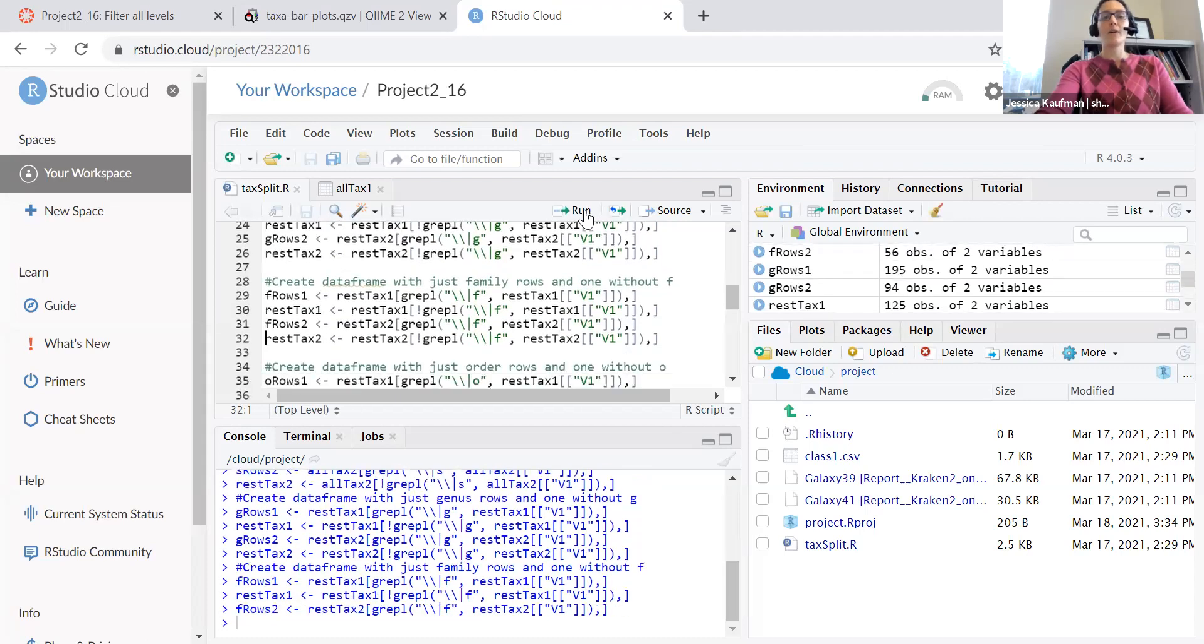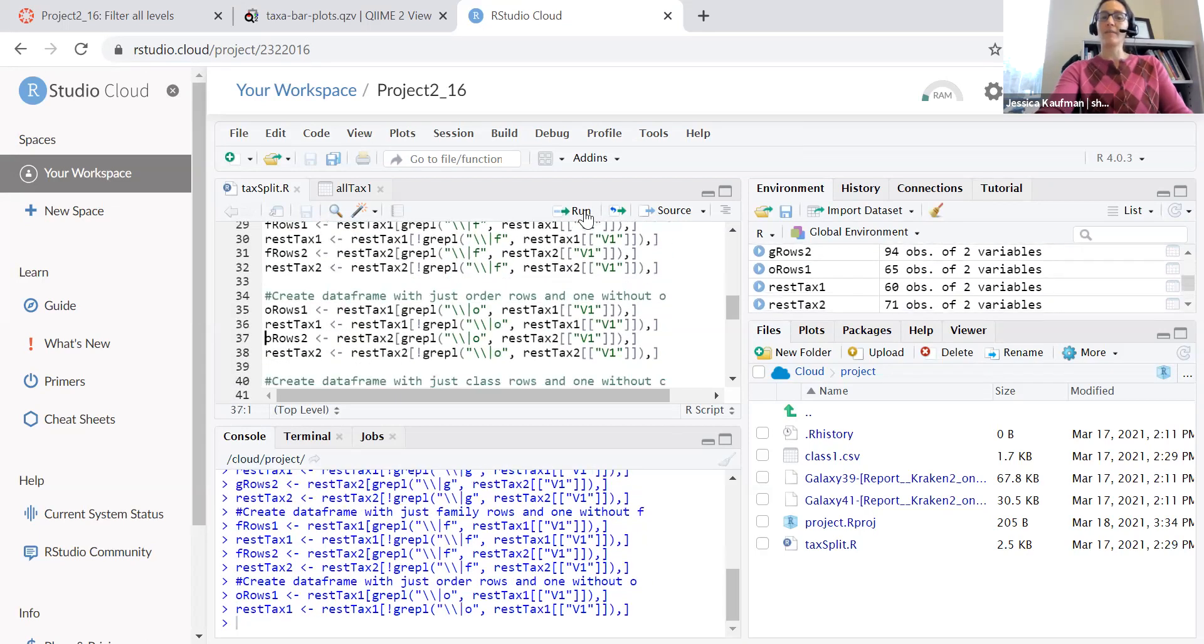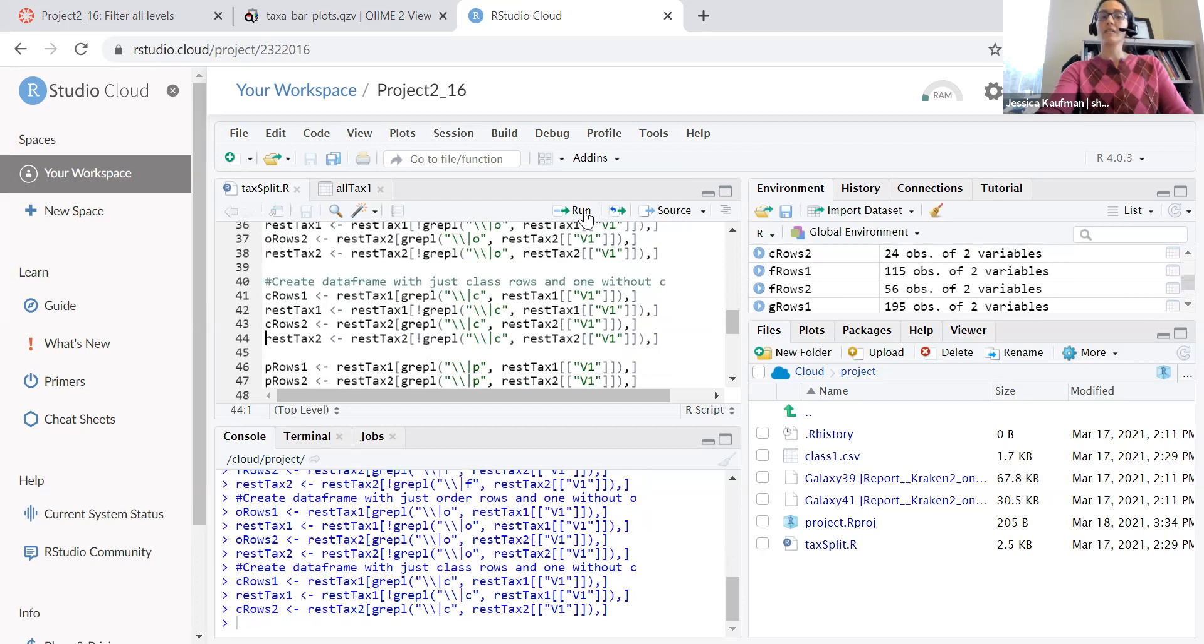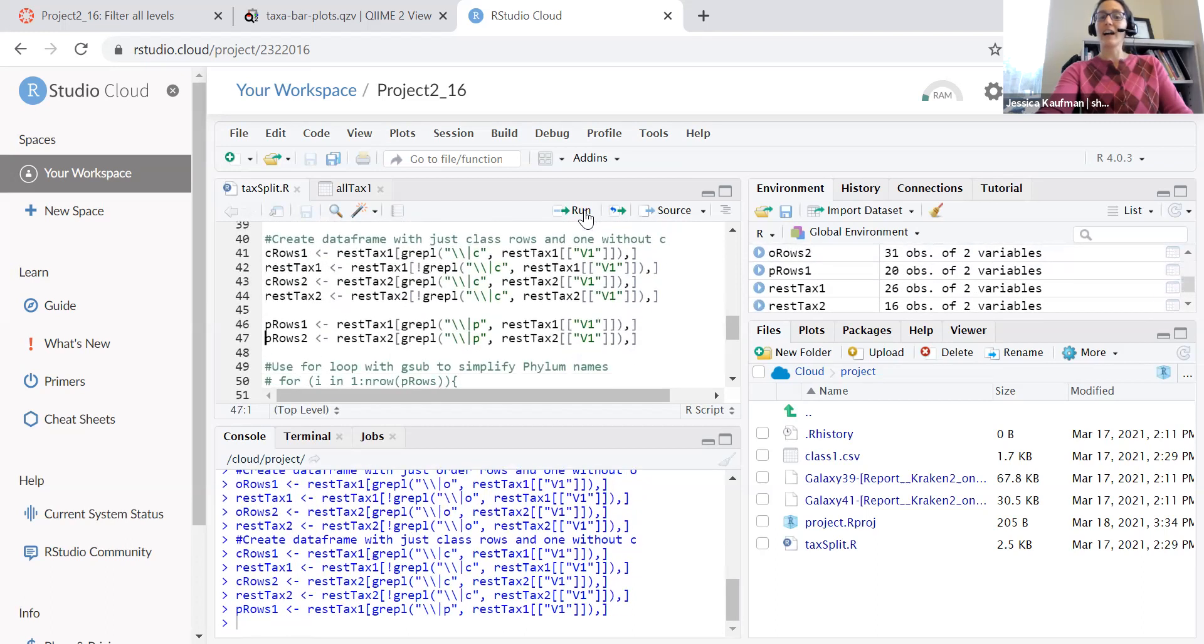I can keep going on with this logic for family, order, class, and finally for phylum.